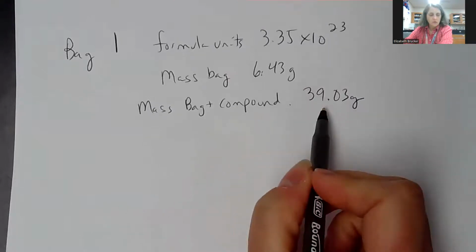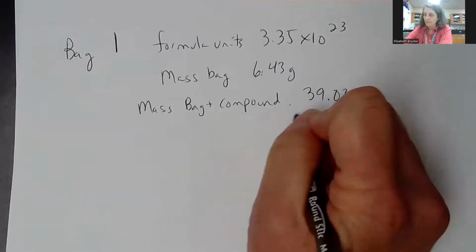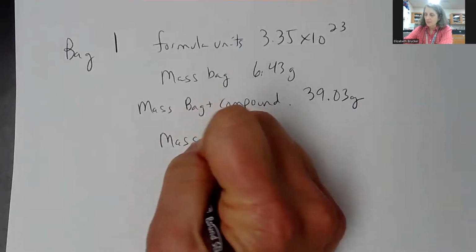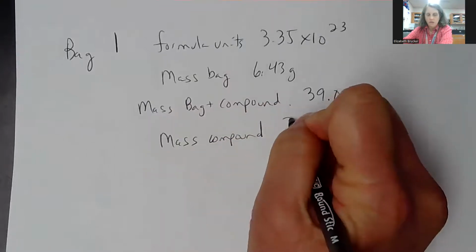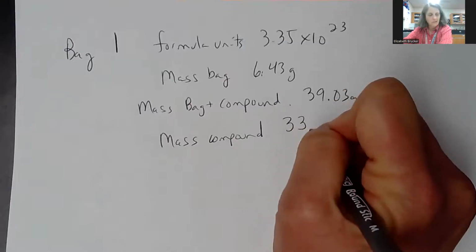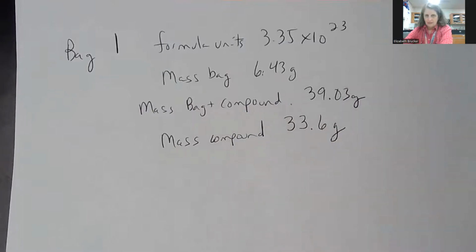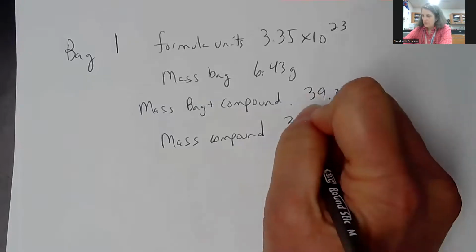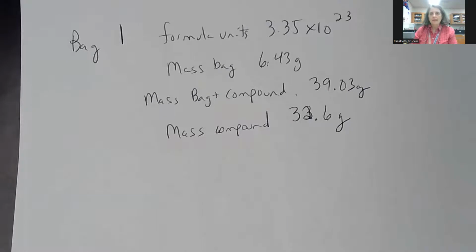When I subtract those two numbers, I should get the mass of the compound, which is going to be 32.6.